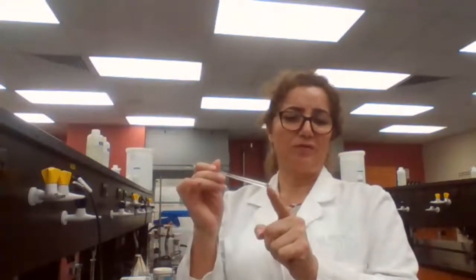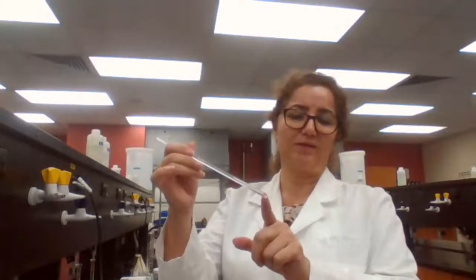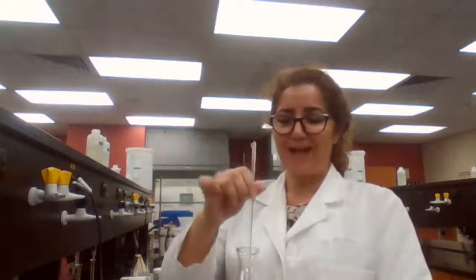You end up with a dull color or a powder, so it's not clear glass anymore, with crystals attached to the tip of the stirring rod. You place that back into the solution, and those particles are going to detach and go into the solution and act as seeds for crystals. And that's the cleanest method, and it's easy. You don't put any glass in there.